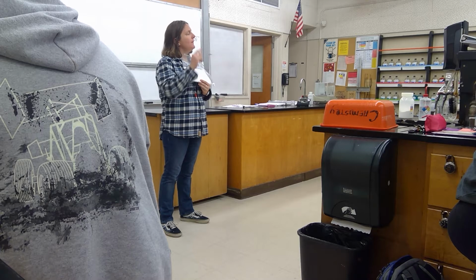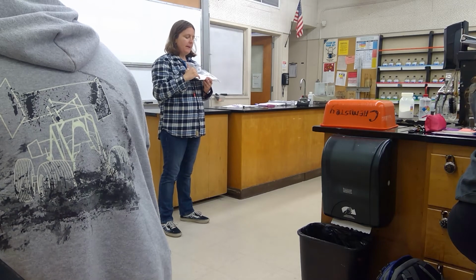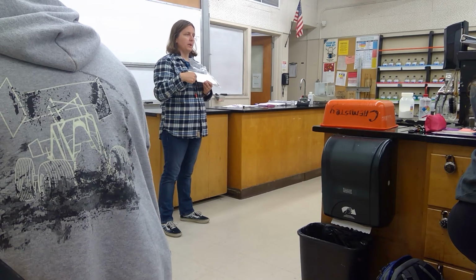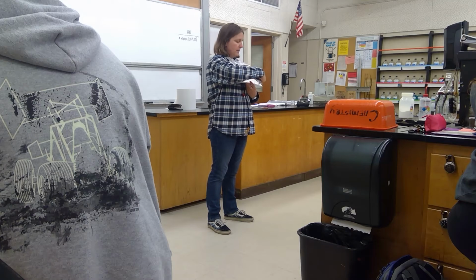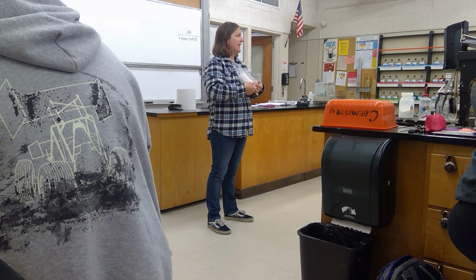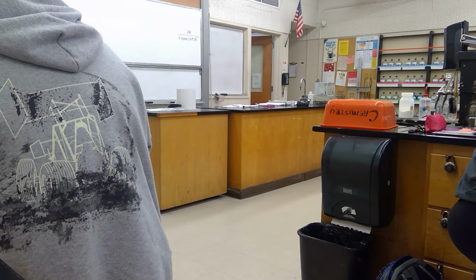And so do you remember with the chromatography plates, you had to mark a line where you were going to spot like the aspirin and so forth? So same thing. Maybe a centimeter and a half from the bottom. Use a pencil so that it doesn't bleed when we put it into the solvent. So you're going to mark that. And I think this paper kind of curves inward, so I want you to spot them on the inside, because ultimately we're going to staple these together next week. Not today, but eventually we will. So spot them on the inside of the curve.